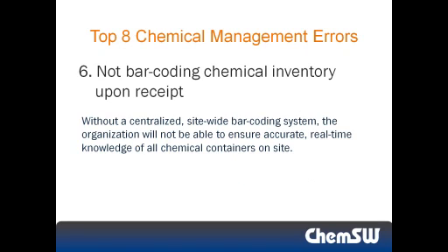My earlier example of leaving inventory checkup to the people with no true inventory control or centralized receiving is a primary example of what not to do. Organizations with no central receiving area, either at the site level or at the department level, have no ability to account for each container as it arrives on site.